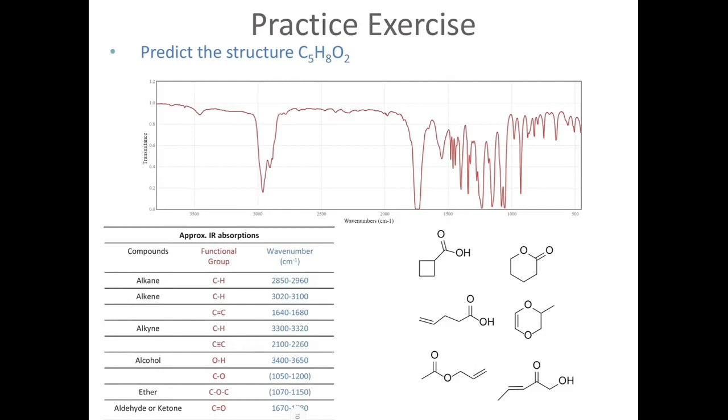And it's time to do some practice exercises. Predict the structure of C5H8O2. In this case, we already have a list of possible structures. We just need to match the spectrum to the appropriate structure.